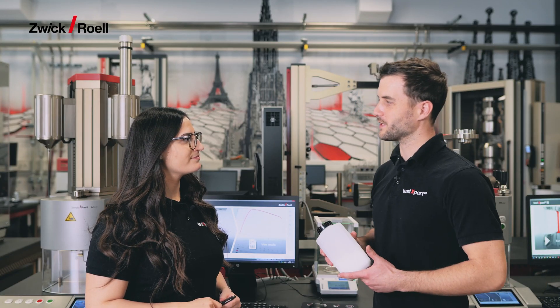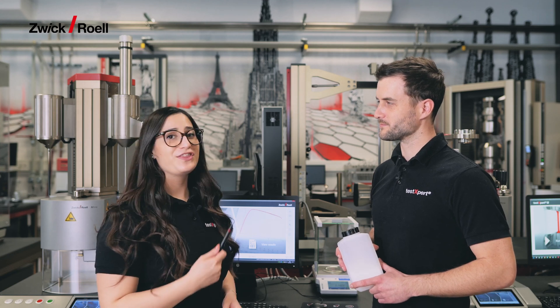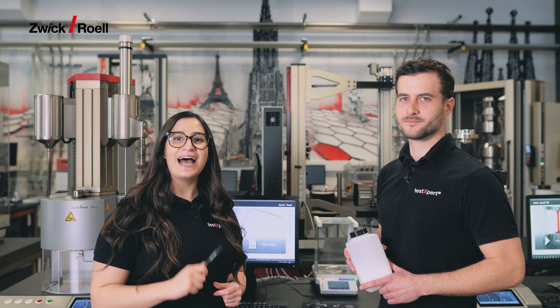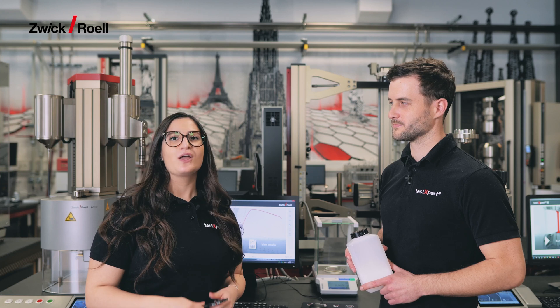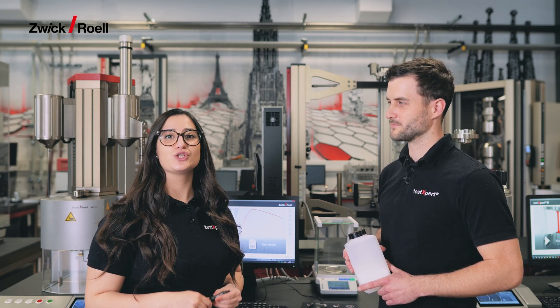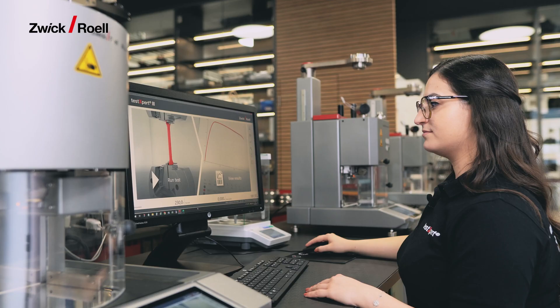Hi Maria, I have a new material that I would like to test. Is there an easier way to do this? The new ASTM D1238 standard now allows the use of force controlled extrusion plastometers. With that, you and also you Valentin have access to not only more but also brand new possibilities. Let me show you.